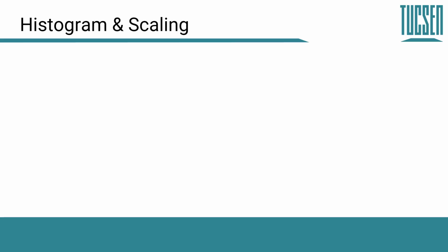So the first aspects that we're going to have a look at for displaying our image is this question of histogram and scaling. So the question is, does our computer monitor truly show image intensity values? And of course we have a camera of a certain bit depth, as we've explored before. Maybe it's a 12-bit camera with 4,000 different grey levels, and we might have image data with a maximum intensity value from our image of maybe 2,000. So the question is, how do we display this data?